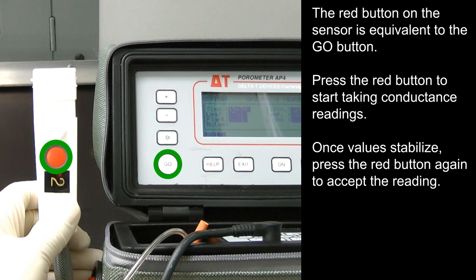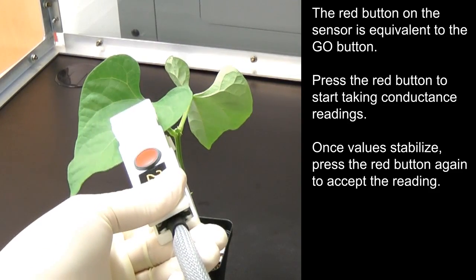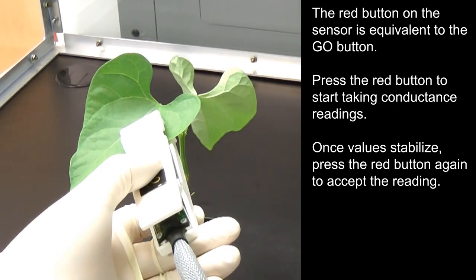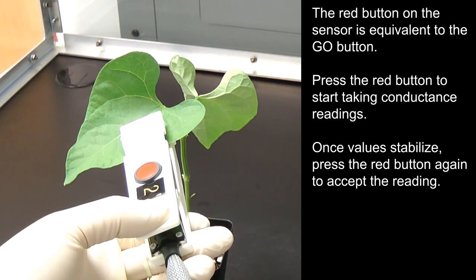The red button on the sensor is equivalent to the Go button. Press the red button to start taking conductance readings.